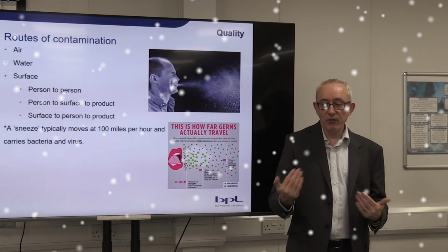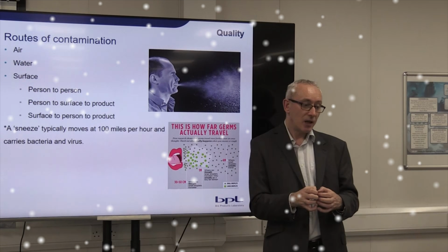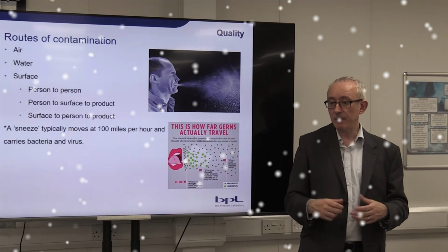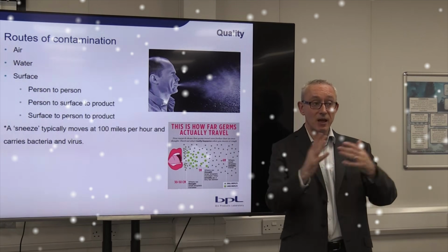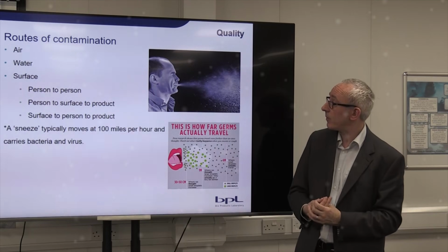But we have to be a bit mindful about where we situate different pieces of equipment. So for example, if we have too much equipment, or let's say we're using a cabinet to do some work, if we put too much in there, we're going to disrupt the airflow, we're going to create eddies and velocities, and things might end up in the wrong place.